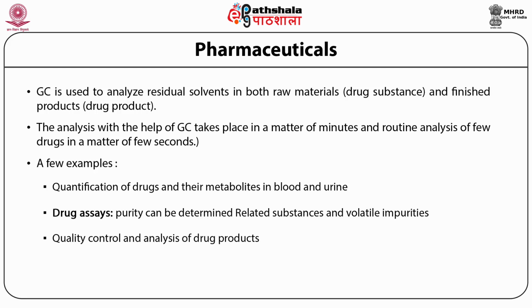Quality control and analysis of drug products like antibiotics, for example penicillin, antivirals, for example amantadine, general anesthetics, for example chloroform, ether, sedatives or hypnotics, for example barbiturates, etc.